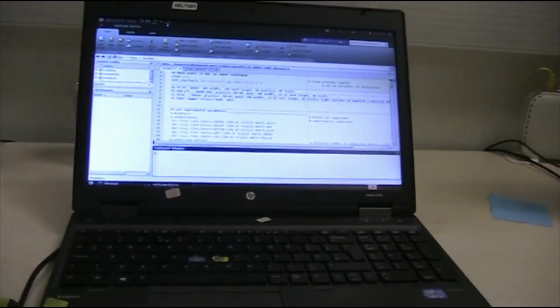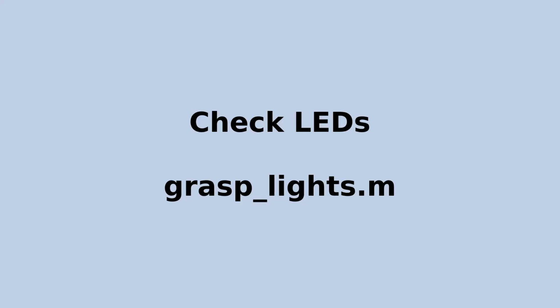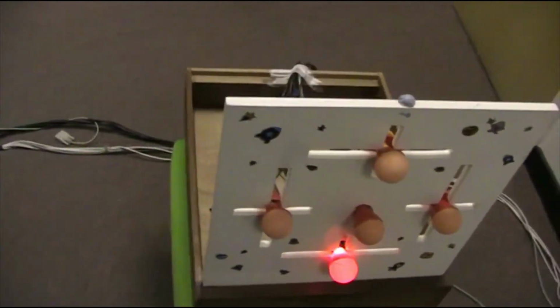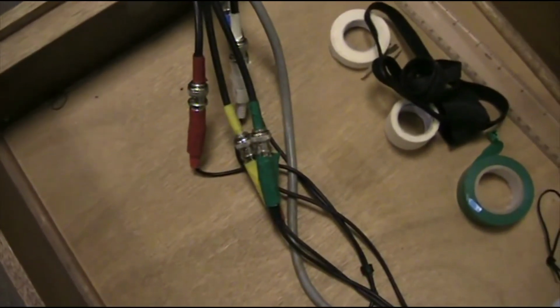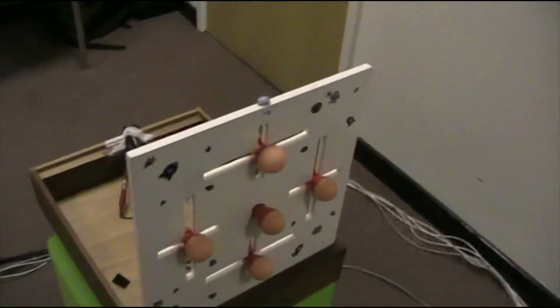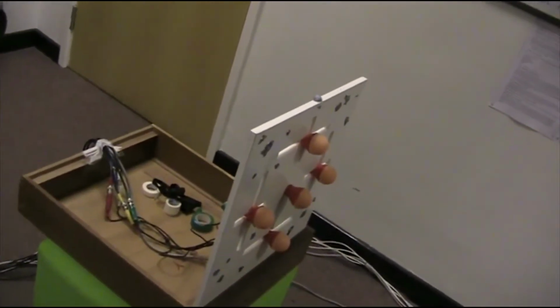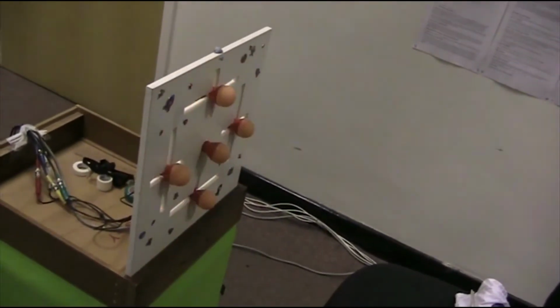When MATLAB is booted up, check the computer is communicating with the stimuli. Usually in this experiment, one of the lights is on when you boot up. They're all connected by 5 color-coded cables at the back of this stimulus display board, and we can check they're all working using the grasplights.m test program, which turns them all on for 1 second and then off again. And we can just watch that again. And if these lights don't turn on, then turn everything off, check the cables, turn everything on again.